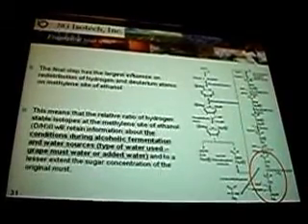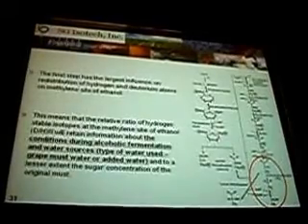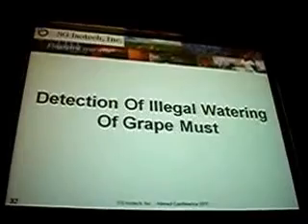Which type of water was used? Was it natural grape water or was it added water? And to a lesser extent, of course, the sugar concentration in the original must. So, detection of illegal watering of grape must.